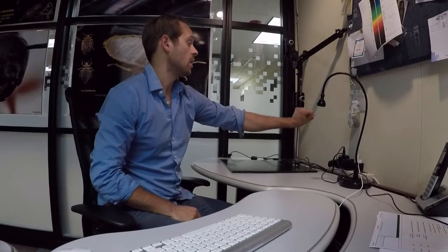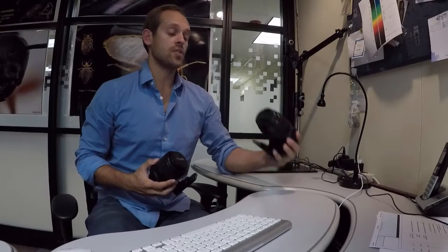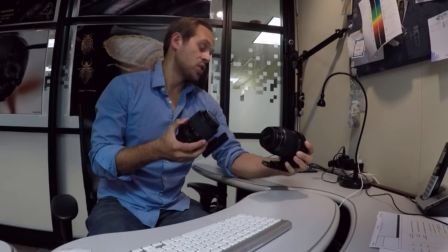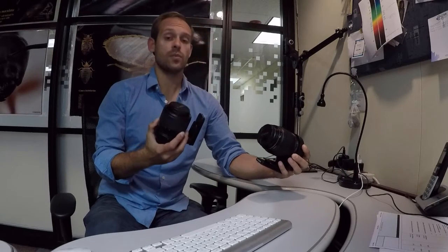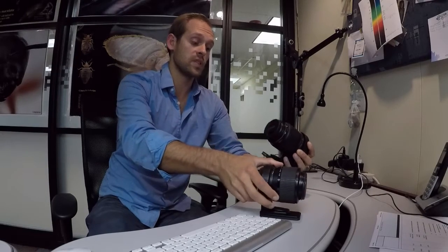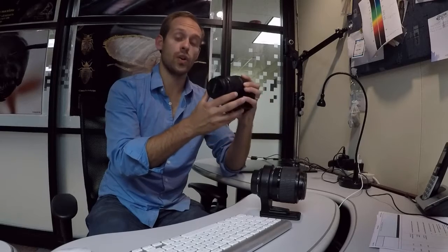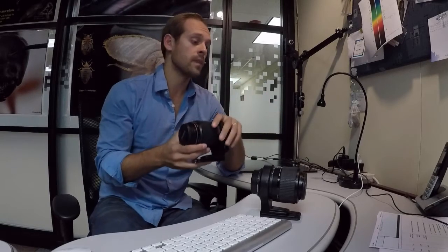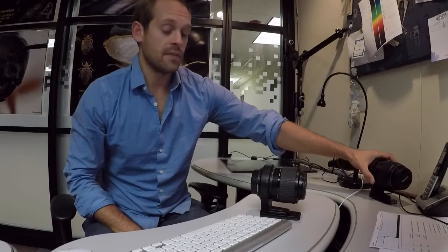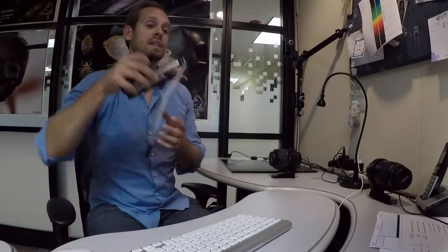There are two lenses that come with the system: the 100mm and the MPE-65. If you're shooting samples smaller than four centimeters, use the MPE-65; if samples are larger than four centimeters up to about 10 inches in diameter, use the 100mm. Today we're using the MPE-65, so I'll set the 100mm to the side.